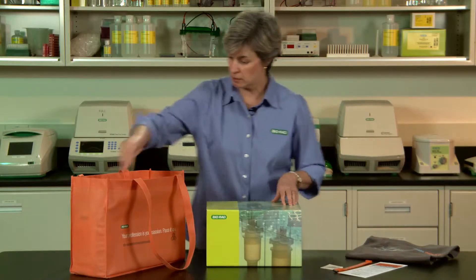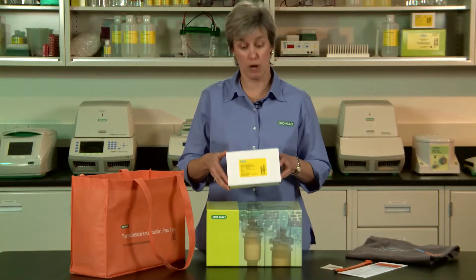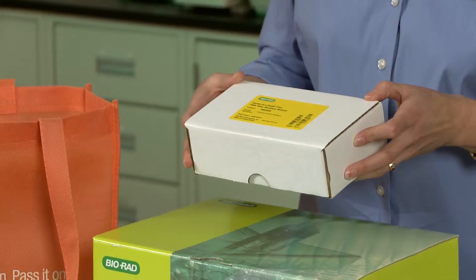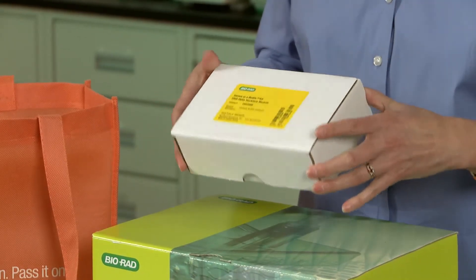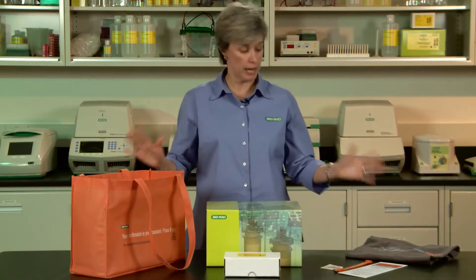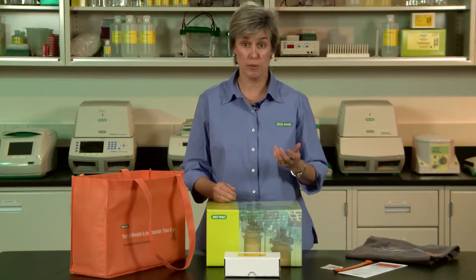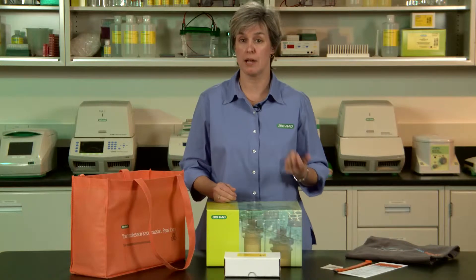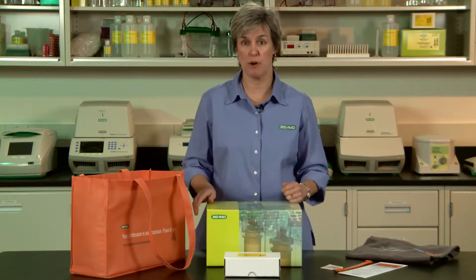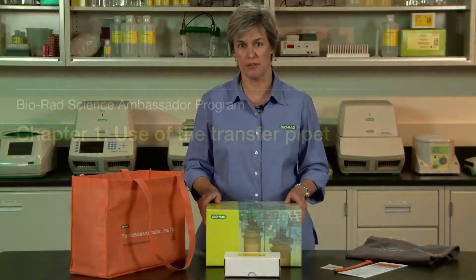There's a second box — this little white box — and this has the DNA necklace modules themselves, all of the little amulets that are shaped like a DNA helix. So as soon as you get your kit, you really want to review your materials. You need to provide a few extra pieces, such as some small paper cups and some alcohol, and you want to be prepared for the day. Make sure you've gone through everything and you'll have a really smooth, successful event.